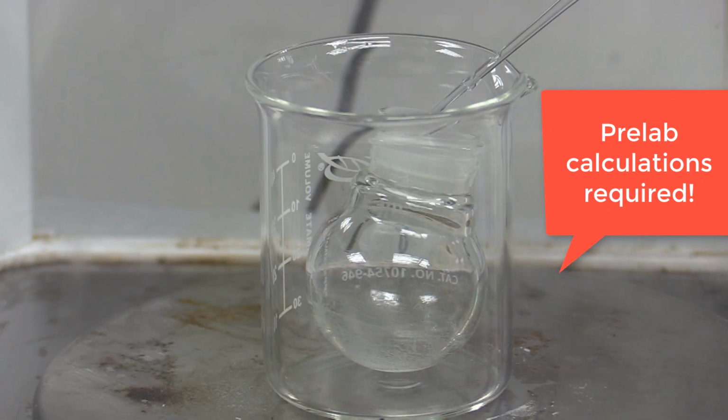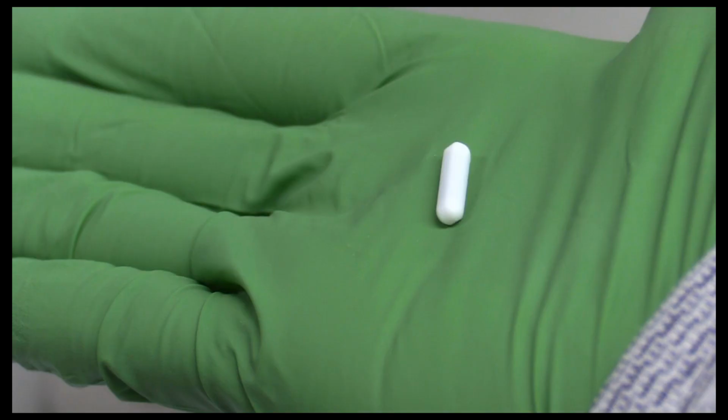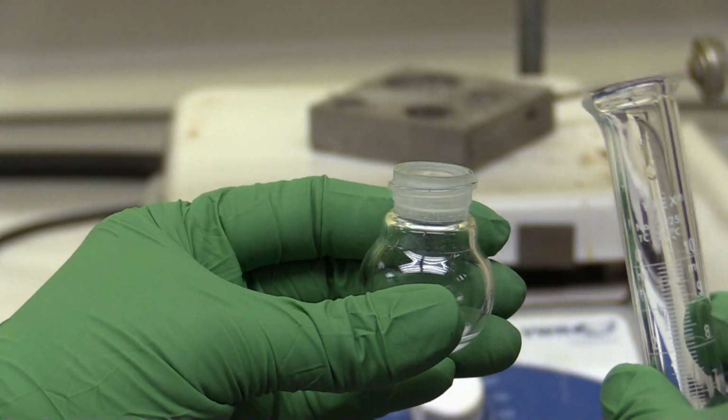Weigh out the wintergreen directly into a round bottom flask. You will need to add a magnetic stir bar to your flask. It may look like a Tic Tac, or it may look like a pizza slice. Drop it into your reaction mixture.